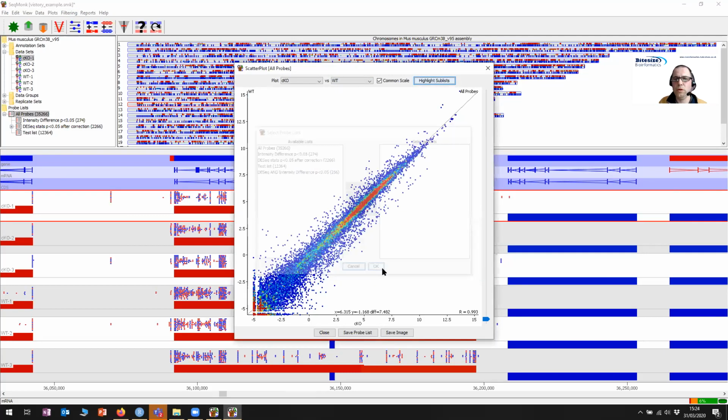So what you can now do is, you've always been able to put your mouse over a probe to see what it is, but now if you click on it, that label will persist. So I can start labeling up interesting points in here, and those labels will stick. If I want to get rid of them, I can get rid of them individually just by clicking on them again. Or if I want to get rid of everything, I can triple click.